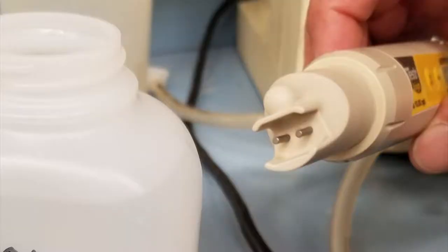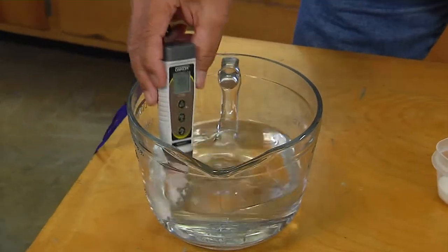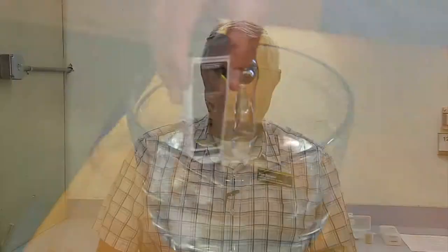On these meters it measures the conductivity across one centimeter, and there are two probes on here, as you can see, one centimeter apart. To make sure that the meter is correct and reading right, we can do a simple test in your home using salt and distilled water.